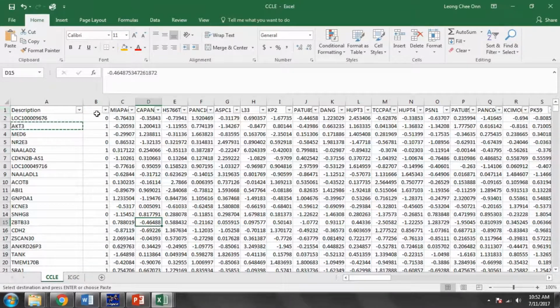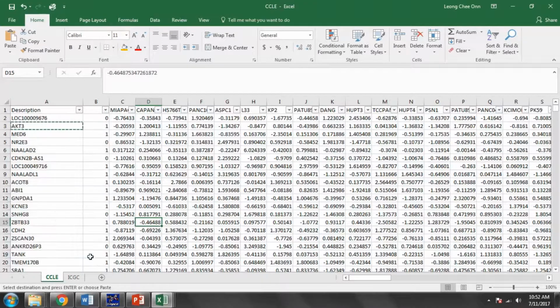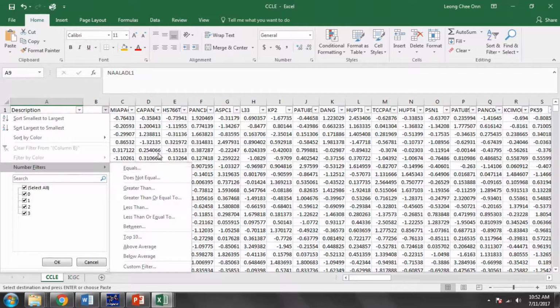So now what I'm going to do is delete those that are... okay, so in the microarray, sometimes you can have more than one probe set targeting the same gene. So when you want to do the classification later on, it is important that you only have one unique identifier. If you have two entries with the same gene, the algorithm would not be able to reconcile which one is which. It cannot treat two entries as the same.